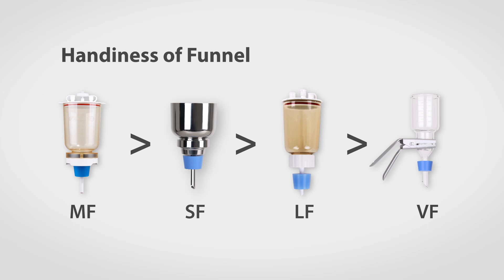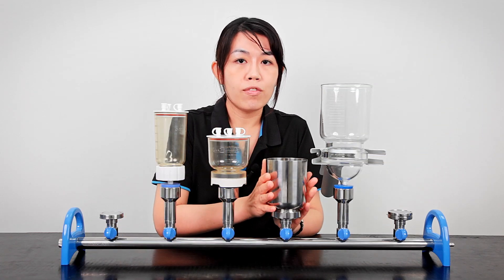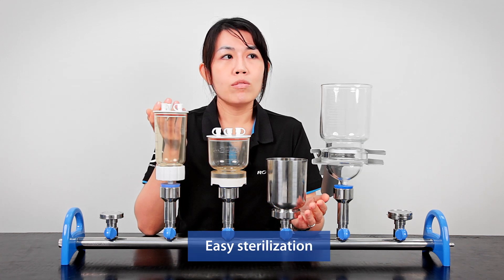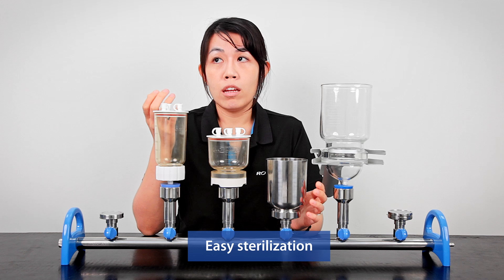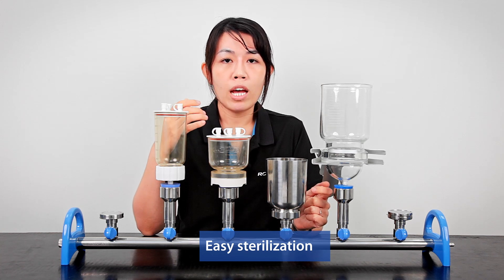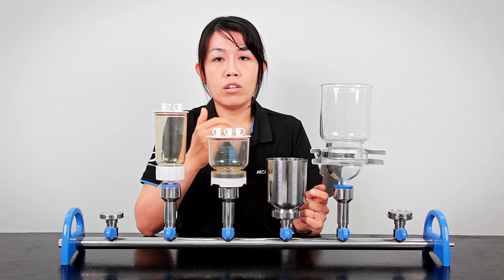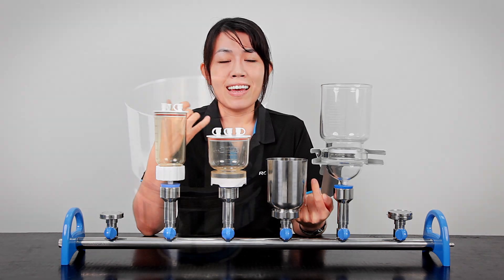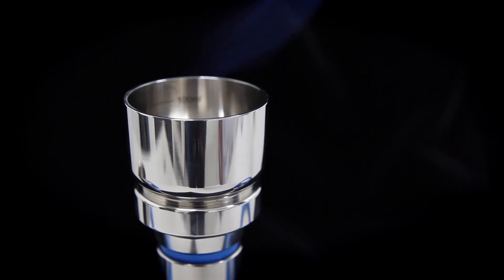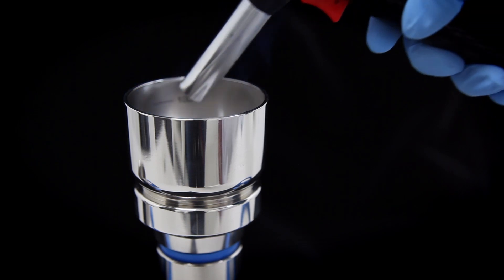One more thing worth mentioning about the SF funnel is that it's very easy to sterilize. For example, if you're doing microbiological testing and need to sterilize the funnels in an autoclave oven — which usually takes hours — with the SF funnel, you can simply use a torch and sterilize it with flame, and that can be done in seconds.